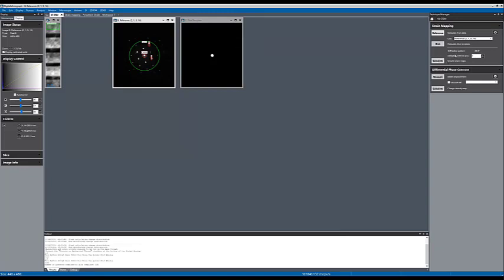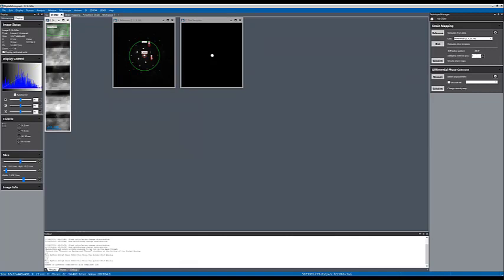One other thing, a couple other things: if you have collected a data set in which the region that you collected does not have an unstrained area, it is possible to also collect data from a different region of the sample that you know doesn't have any strain, calculate the reference from that data set, and then use that reference diffraction pattern and apply it to the data set that you know has strain.